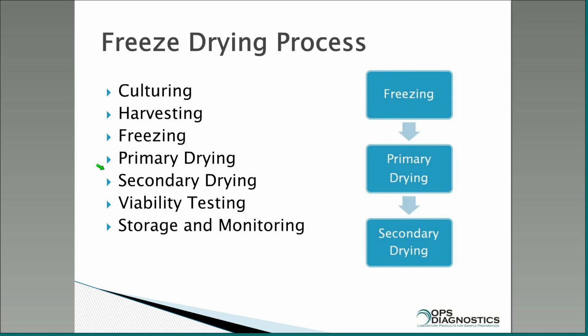Then secondary drying is after you remove the bulk of the water from your sample. There might be some residual water, and in something like a shelf dryer, you can pump heat into your sample to push out additional water.